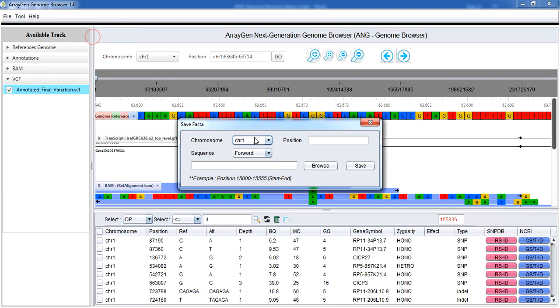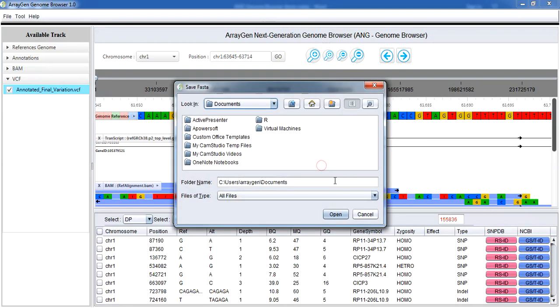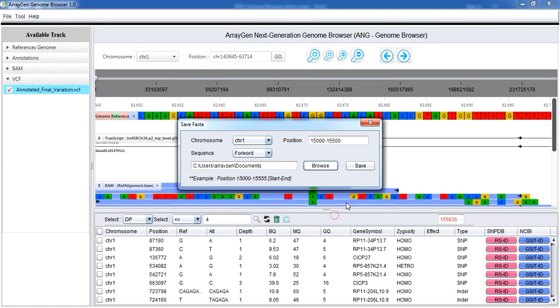Required portion of the reference sequence can be exported by selecting chromosome number, start and end position, forward or reverse strand.